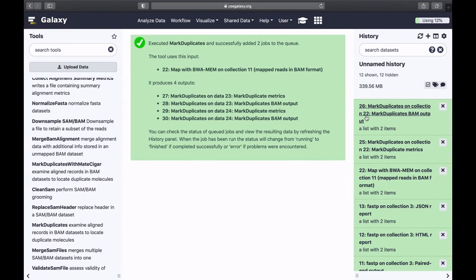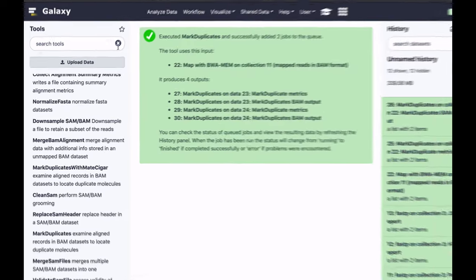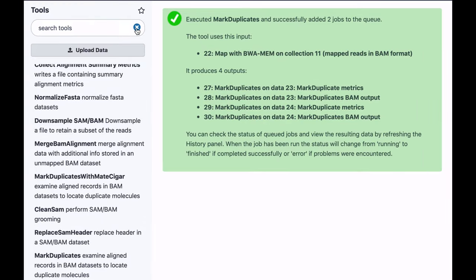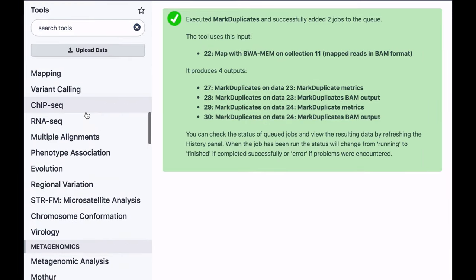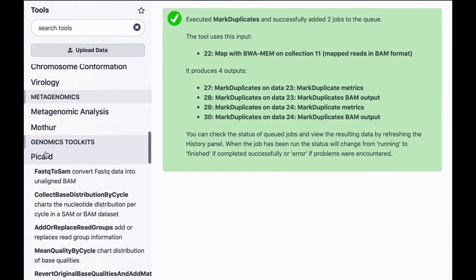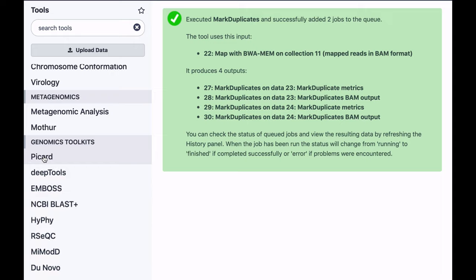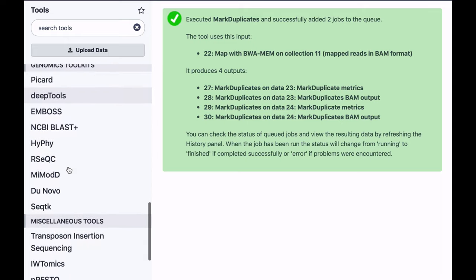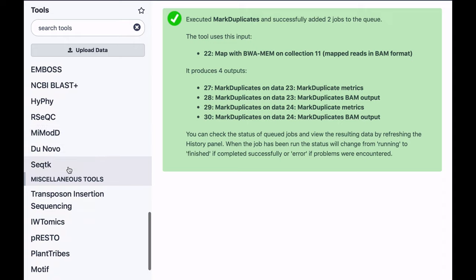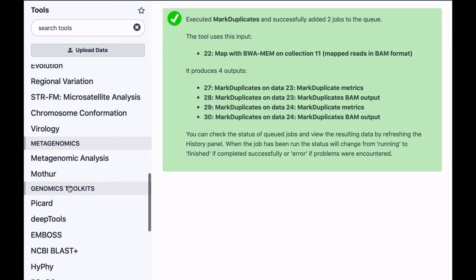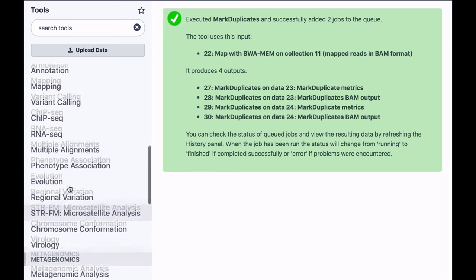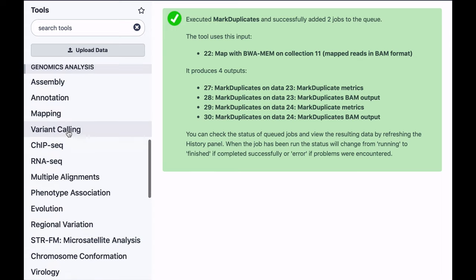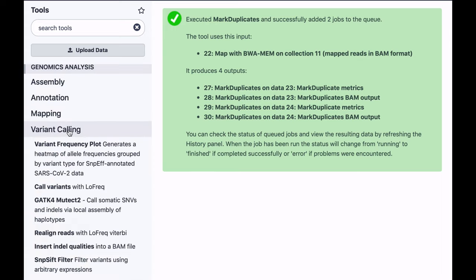At this point, we can use this deduplicated mapped data set to actually go ahead and start calling variants. Here, we are going to call variants using tool called LOFREQ, which is specifically designed for calling low frequency variants in mixtures, such as viral or bacterial samples.